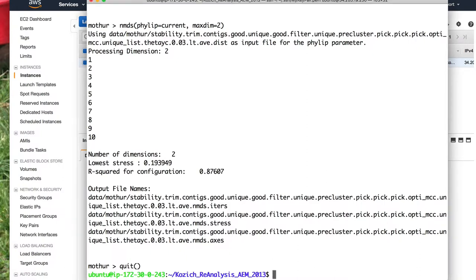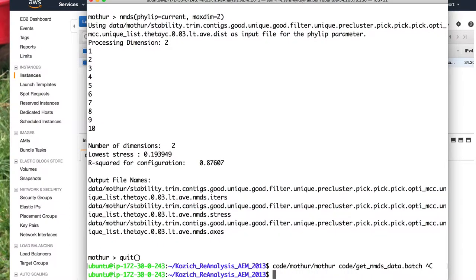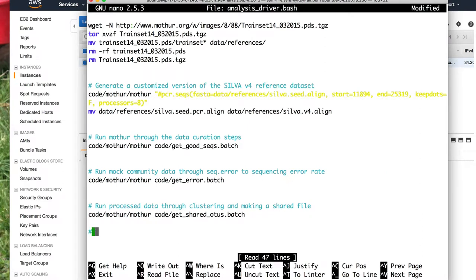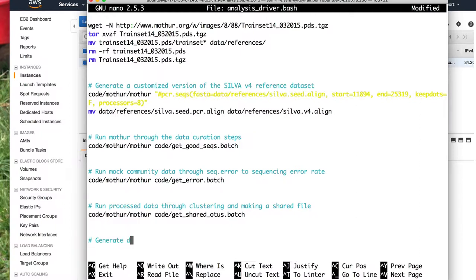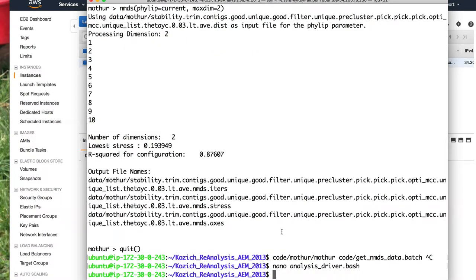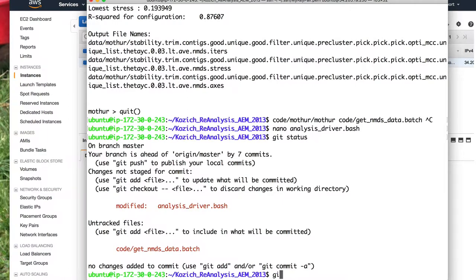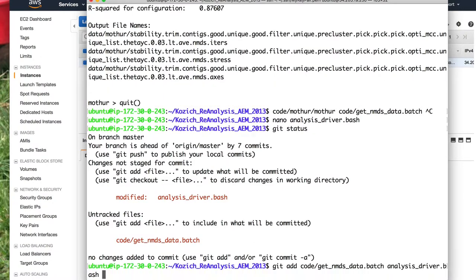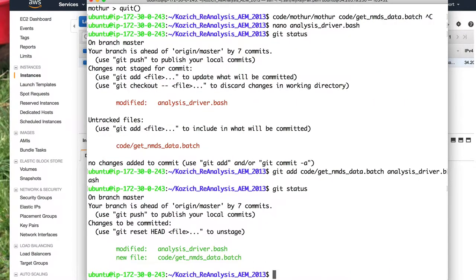We need to add that to our analysis driver file. I'll up-arrow to get the previous command, highlight it, hit Ctrl+C to get off that line, do nano analysis_driver.bash, and come down to the bottom to add a comment to generate data to plot NMDS ordination. We need to commit this change: git status, git add code/get_nmds.batch, git add analysis_driver.bash, git status — both have been staged — git commit -m 'generate nmds ordination data'.